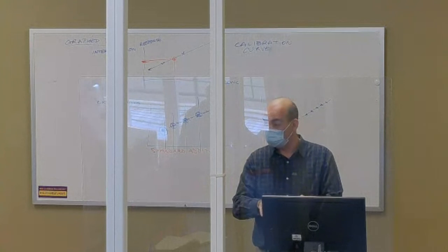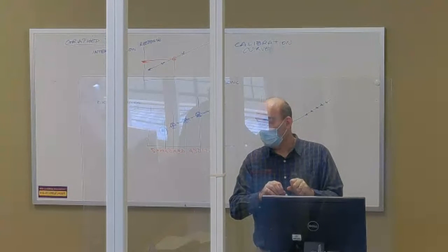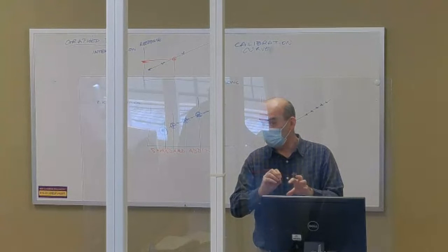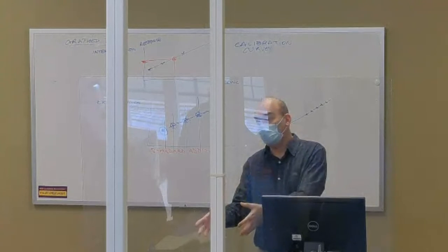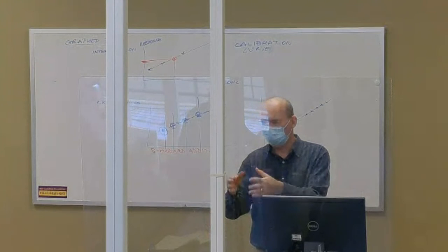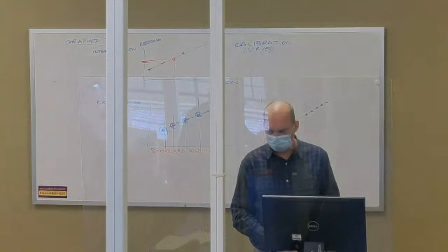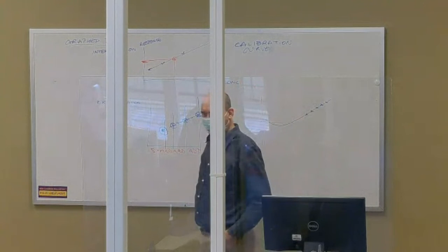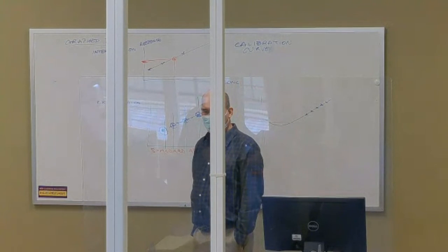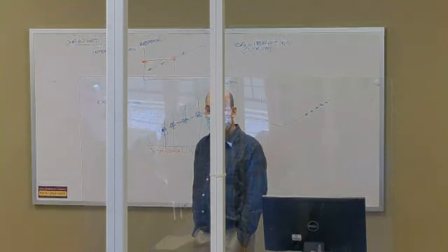I'm going to collect a bunch of those, write them up, and then ask you, look at this calculation, now do another one. Okay, and we're going to go through that, and I'm halfway writing a quiz with buzzwords and whatever. We're going to do some calibrations next time in lab to make sure that the glassware that we're using equals what we're expecting.